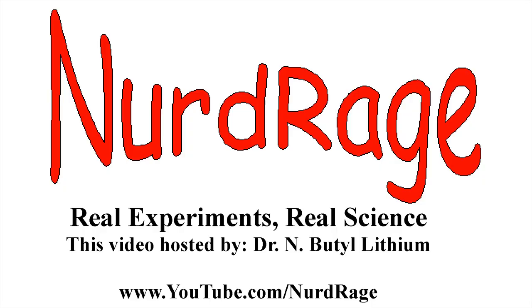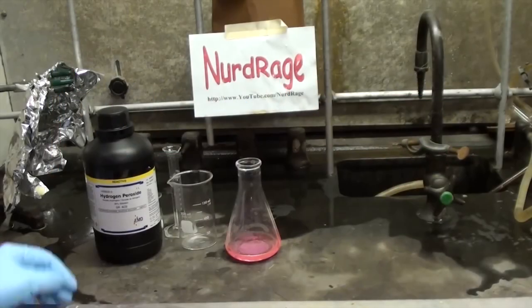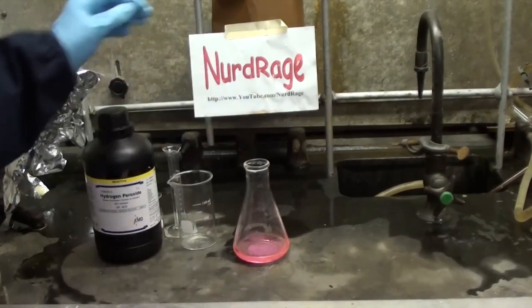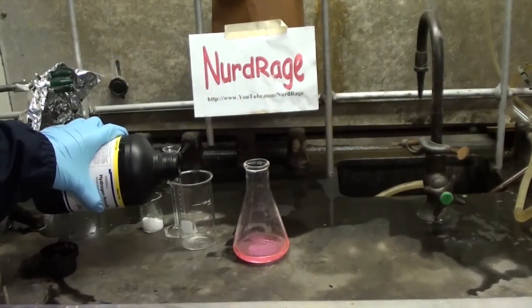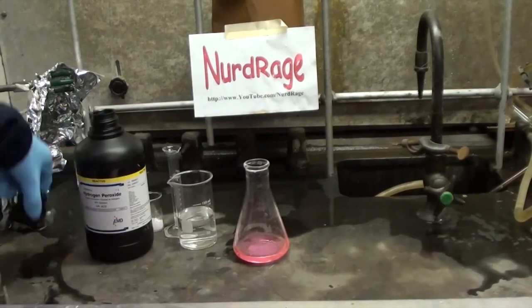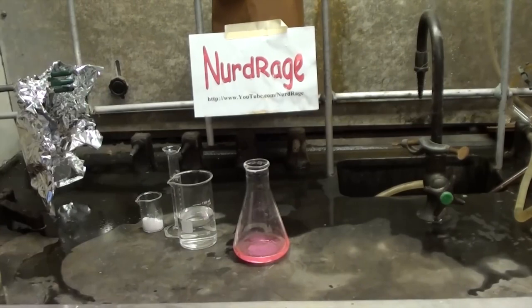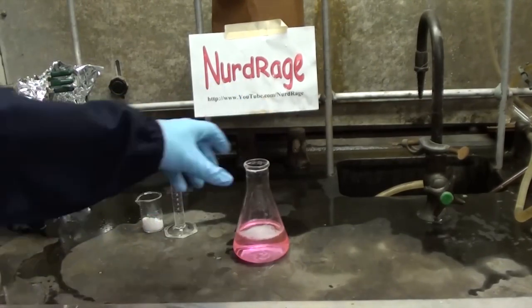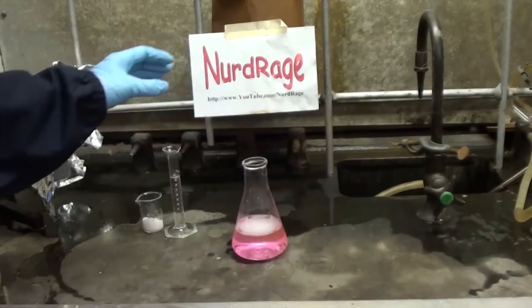Greetings, fellow nerds. In this video, we're going to do the classic demonstration of elephant toothpaste, which is actually just a fast expanding foam. To do this, start with 50 milliliters of detergent. If you can blow bubbles in it, it'll work. Now we add to it 100 milliliters of 30% hydrogen peroxide. This peroxide concentration will cause burns, so be careful when handling it. Wear gloves. Now mix it up.